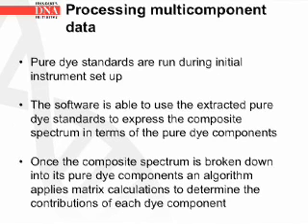Pure dye standards are also run during initial instrument setup. The software is able to use the extracted pure dye standards to express the composite spectrum in terms of the pure dye components. Once the composite spectrum is broken down into its pure dye components, an algorithm applies matrix calculations to determine the contributions of each dye component.